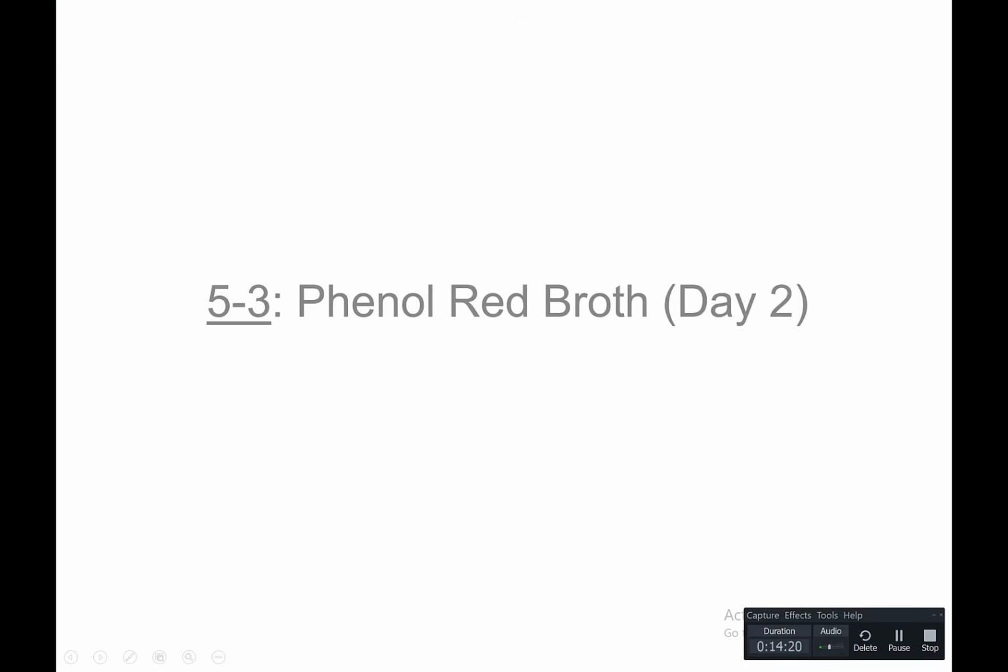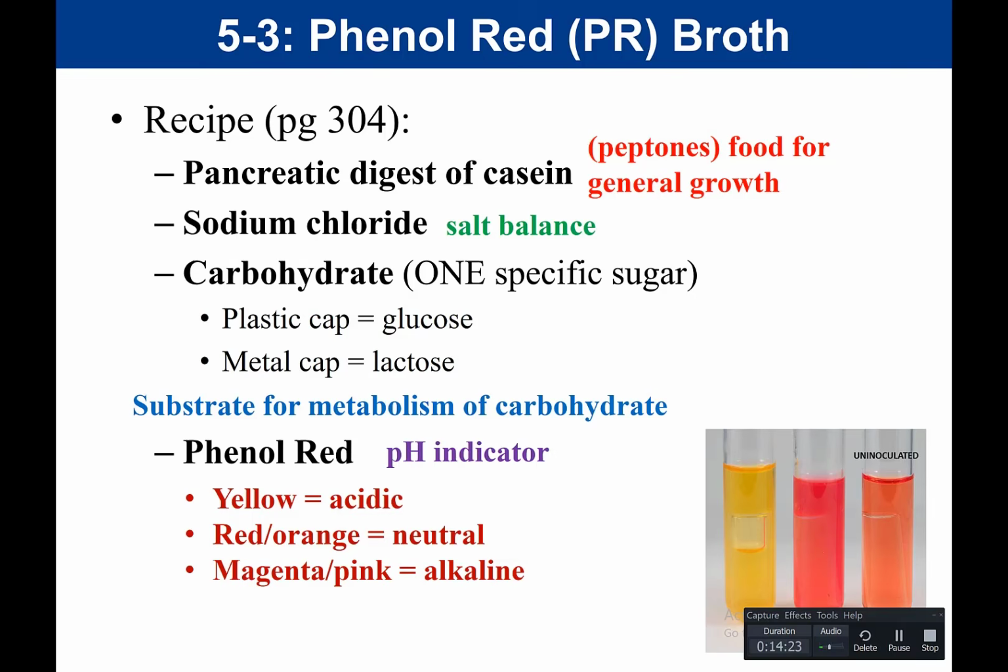So for day 2 of our phenol red broth, when you're studying, students kind of panic about this in terms of, do I need to memorize all of the ingredients in every recipe? And the answer is no. So you do want to understand that in the phenol red broth test, there are peptones, and that in that media, the peptones are there as food for general growth.